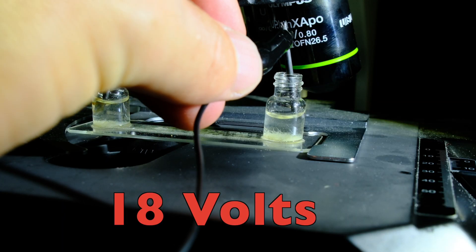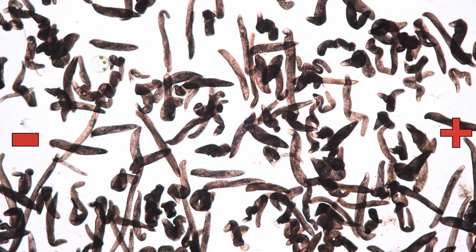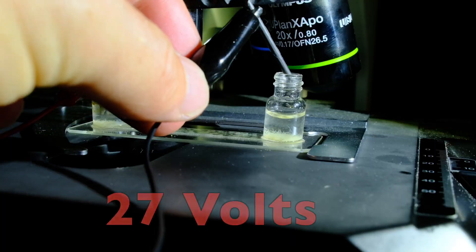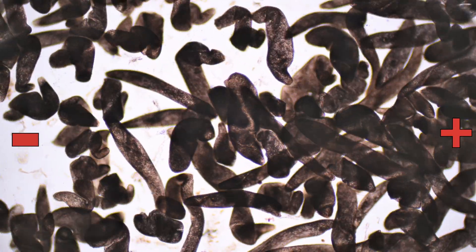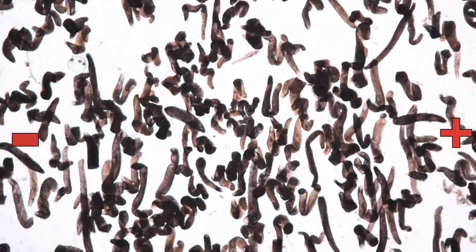You can see clearly the moment when the current begins to kick in. At 9 volts, spirostomum reacts already strongly. Now let's see what happens when we increase the voltage. The individual cells contract uncontrollably and then try to align perpendicular to the electric field. Spirostomum contracts even more, aligns faster in a perpendicular position, and slowly glides towards the direction of the current. When we speed up the footage a bit, we can see the gliding motion towards the negative pole.